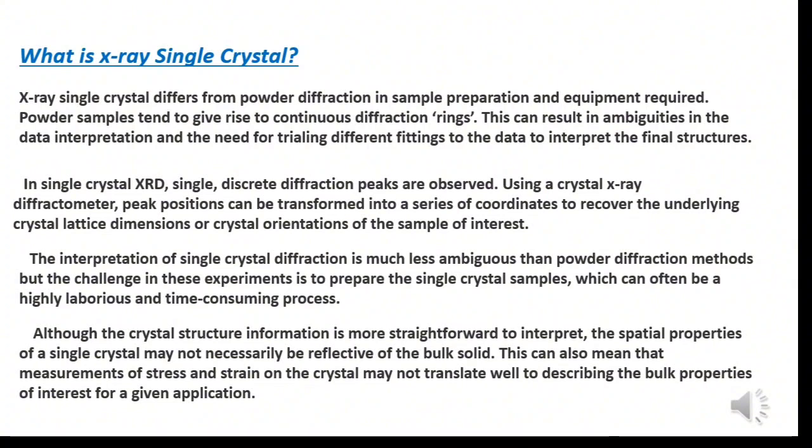The interpretation of single crystal diffraction is much less ambiguous than powder diffraction methods, but the challenge in this experiment is to prepare the single crystal samples, which can often be a highly laborious and time-consuming process.